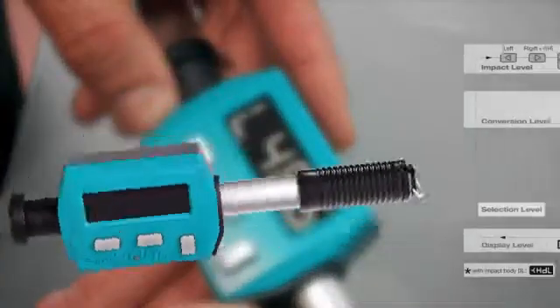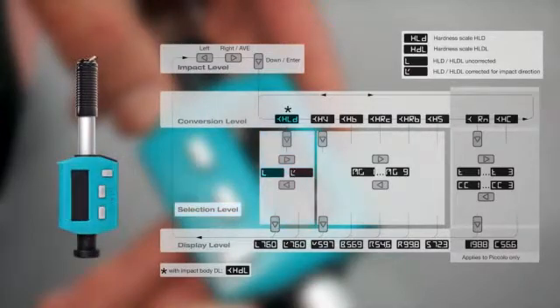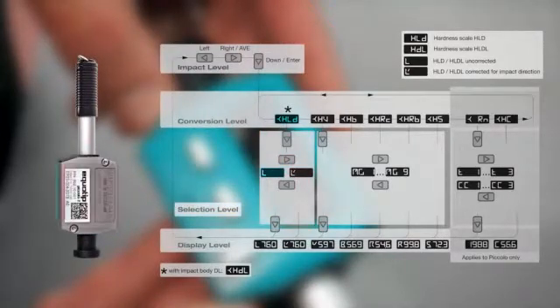If you choose Leib, you can select L, which allows you to use the original uncorrected Leib value. Otherwise, the value is always corrected for impact direction.